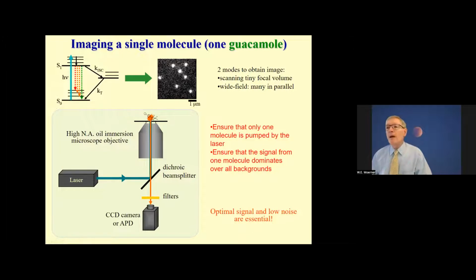There are details about the apparatus, but the important thing I'd like to mention here is that this idea even works with your favorite optical detector, your eyes. You have two of them in most cases, and it's easy to see the light from a single molecule now in our microscopes. There are very tiny points of light that you can see looking inside the microscope. Your eyes are sufficiently sensitive to detect this light, and this is one of the many reasons why you should protect your eyes and never play with lasers. Just recognize that these machines, which are connected directly to your brain, are incredibly sensitive, wonderful detectors as well.